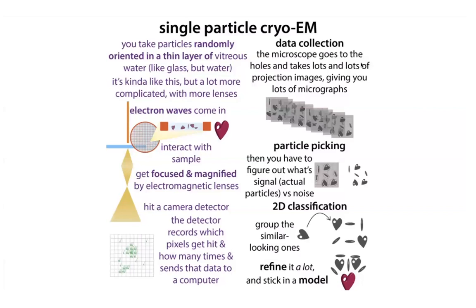You can also, with cryo-EM, see things in different conformations. Sometimes you can see those too. So for example, you might see someone sitting instead of standing or laying. And when they're sitting, well, then they're in a different shape. So if you can isolate the ones that are sitting, and then we have ones where you can see the back of the person sitting, and ones where you can see the front of the person sitting, we can average all of those together.